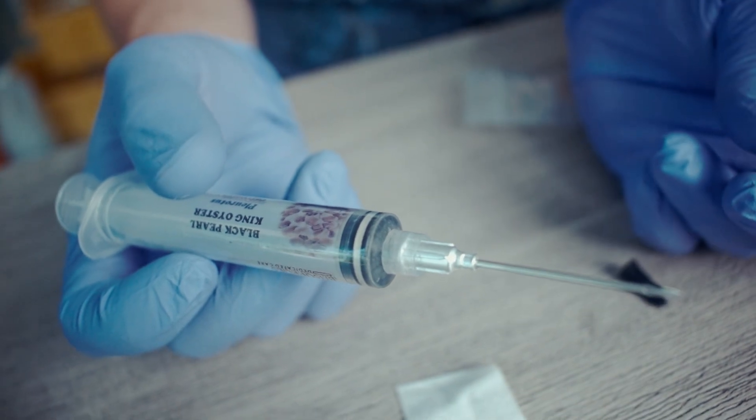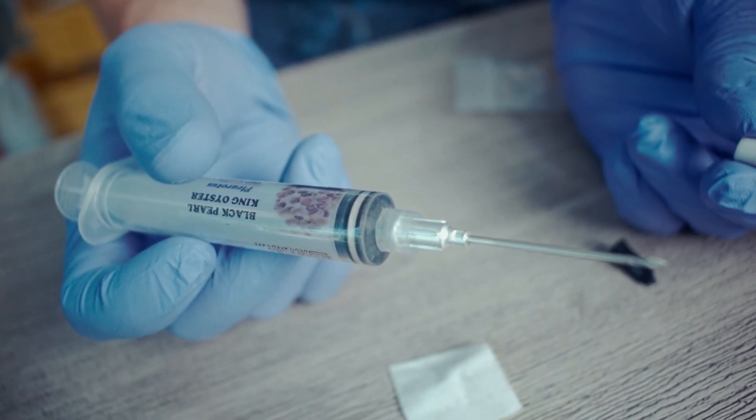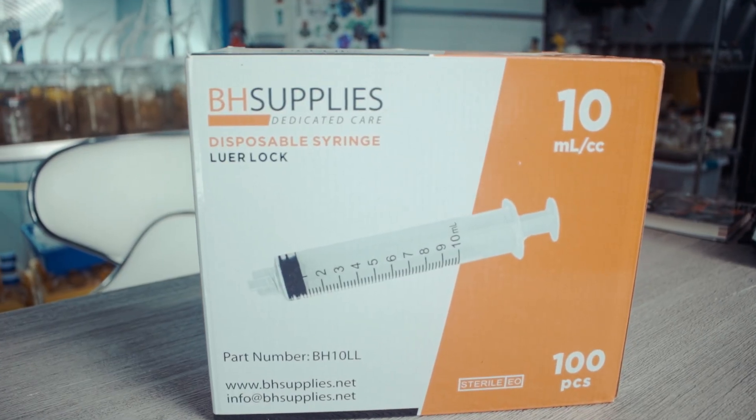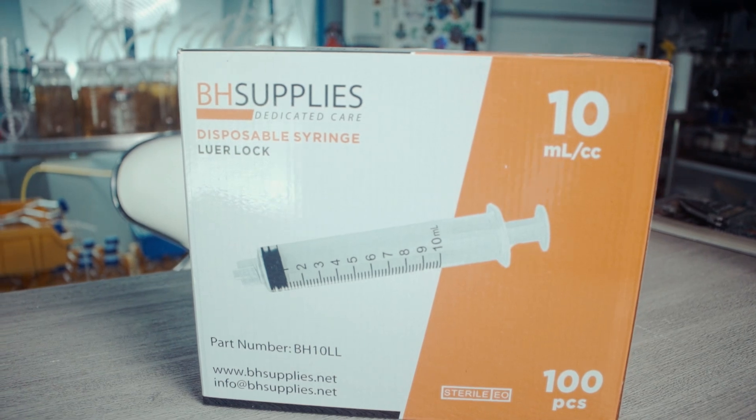Another material you're going to need is a syringe, which will allow you to transfer the material from your jar into your spawn bag or spawn jar. You're going to need sterile syringes — make sure you get sterile syringes, or you can use a glass syringe and sterilize it yourself. Anywhere from about 10 to 15 milliliters is the standard volume. You can get away with less, but that smaller volume should be used just to store your genetics, not for inoculation. You're going to want to use a one-time syringe and not reuse them, because by using a fresh needle and fresh syringe every time, you're guaranteeing that it's sterile.